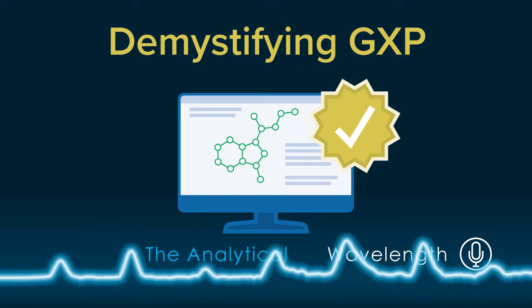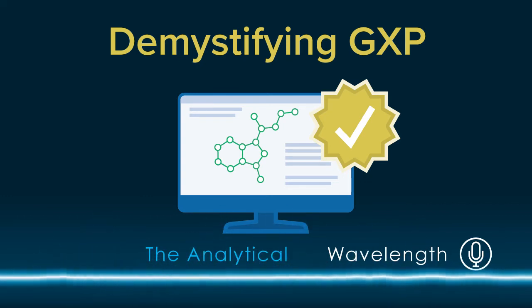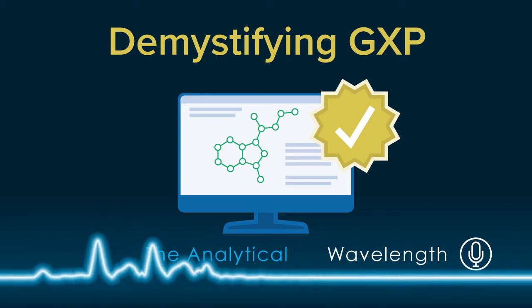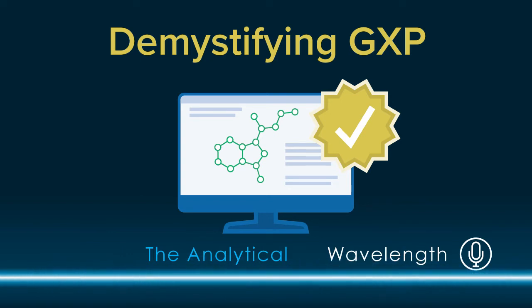So now Part 11 capabilities have to have the software validated, and it has to have all of the functionality of GXP validated software. In addition, Part 11 functionality requires the ability to generate an electronic signature within the software. And this is typically used when the software is deployed in a way that it is used to submit data electronically for FDA filings.